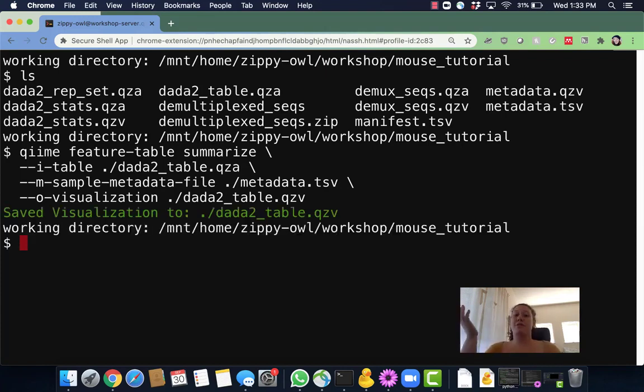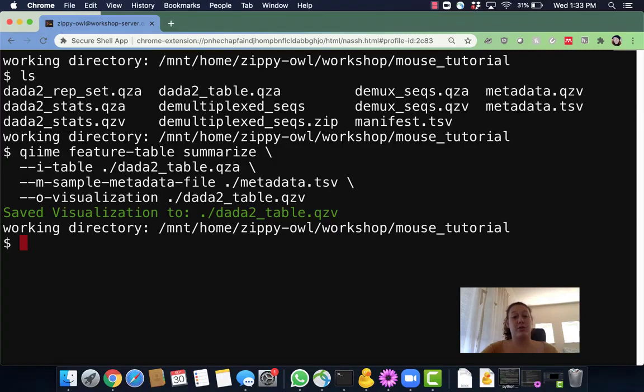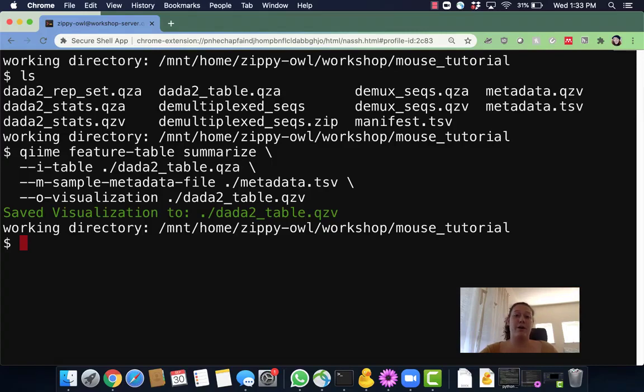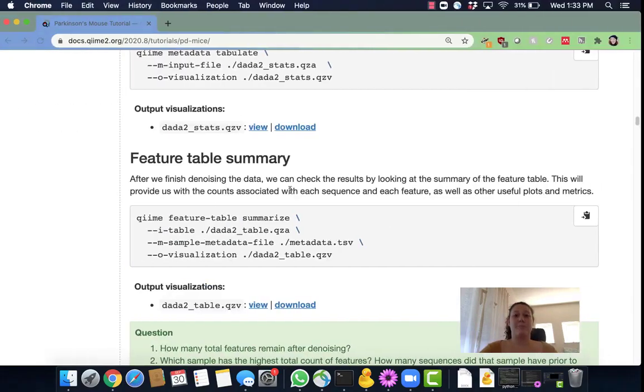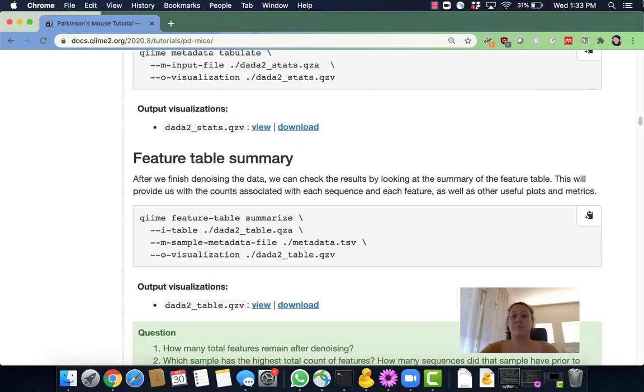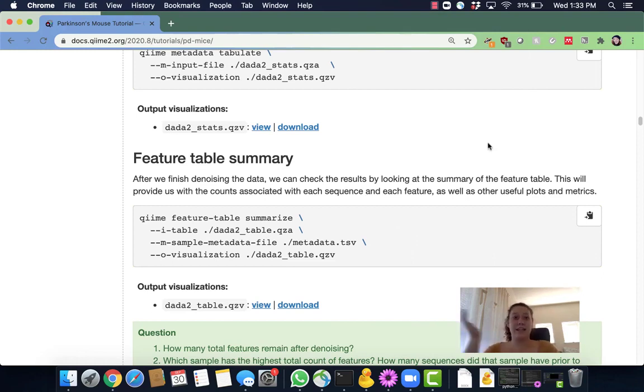So now we have our visualization. I'm not really going to look into this one, but we will look into it later on when we're doing our alpha rarefaction video. Awesome. So thank you guys for listening and I hope you learned a lot.